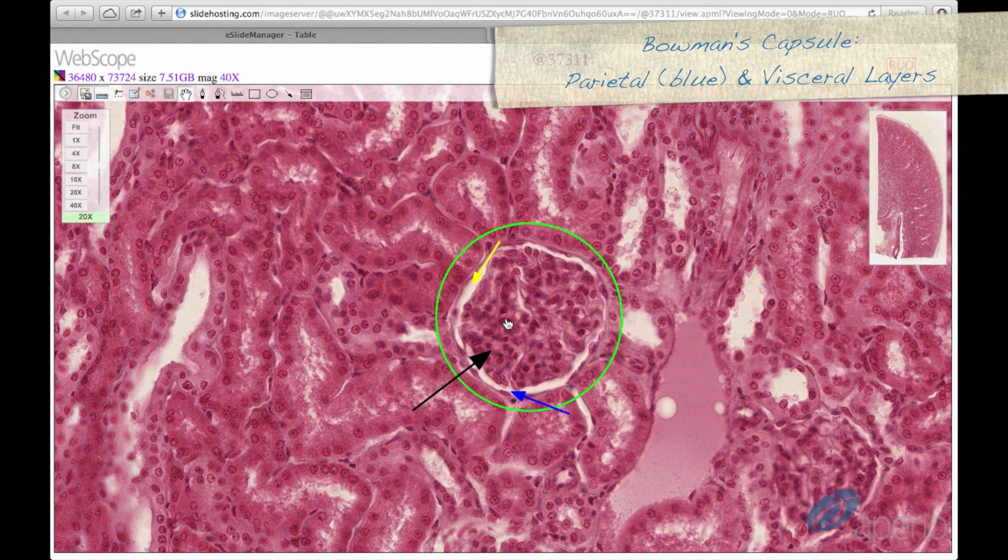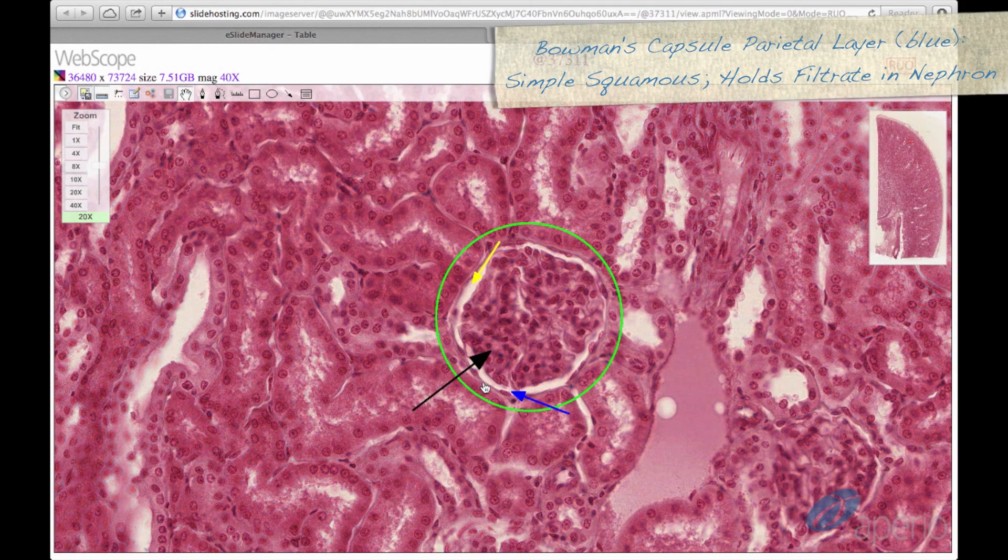Bowman's capsule actually has two layers, a visceral and parietal layer. The parietal layer, seen here at the blue arrow, is composed of simple squamous epithelium and functions to hold the filtrate in the nephron.